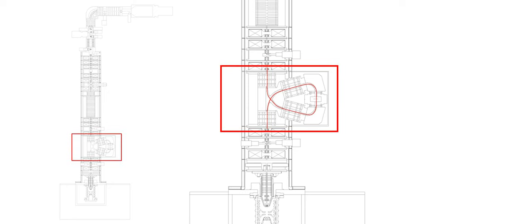And then it's the monochromator. You can see the beam is going from the gun and going to a circle. Those are the energy dispersing unit and energy bending prism. And here is the monochromator slit position. So the beam goes this way and goes back here. And then you can see the condenser lens 1, 2, 3. And you can see the position of the VOA is here. It's after condenser 1 and before condenser 2. And the monochromator aperture is here.